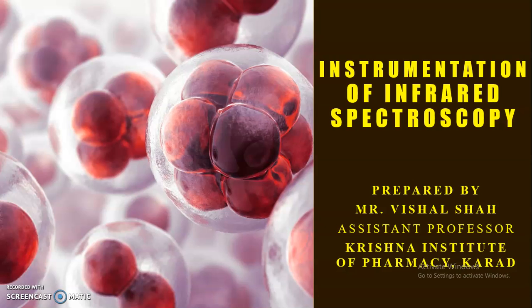Today, in this video, we are going to discuss the instrumentation of infrared spectroscopy. Previously, we have covered the different molecular vibrations that are associated with infrared spectroscopy. We have seen there are basically two different types of molecular vibrations: stretching and bending. Further, these stretching vibrations and bending vibrations are also classified into different types.